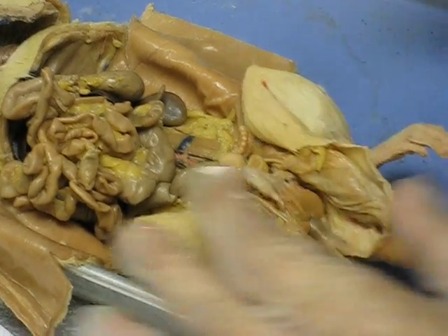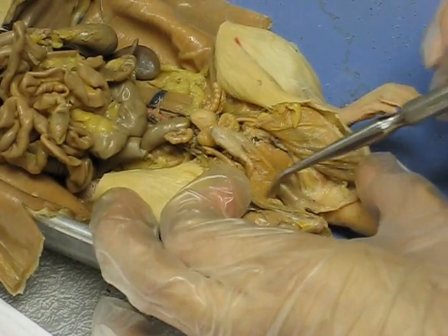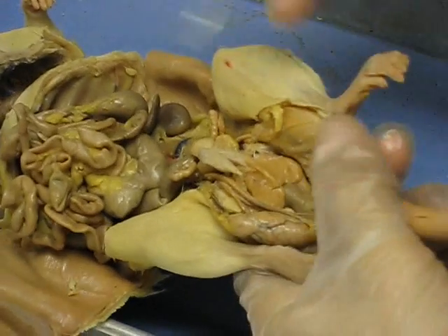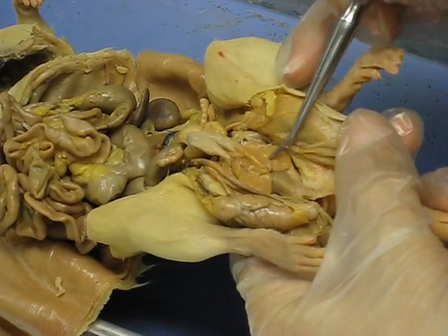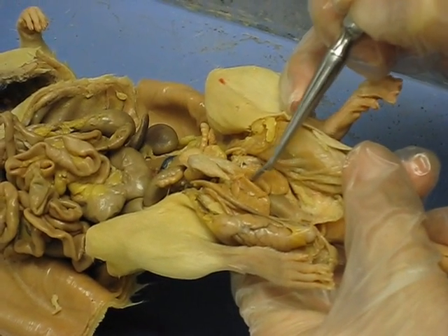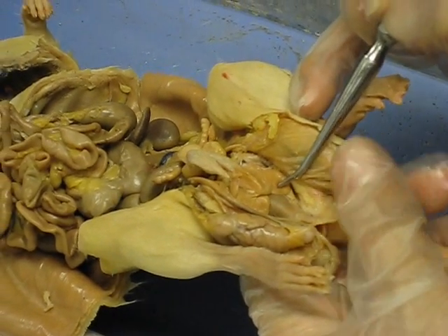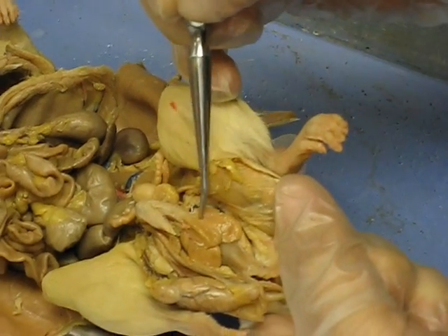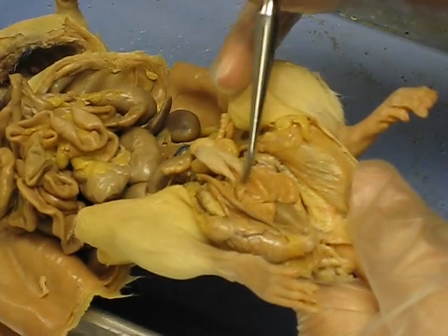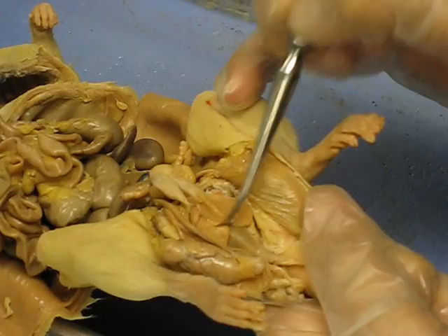Here is the penis, and these are the bulbs of the penis down here. In between the bulbs of the penis you have a muscle — this is the bulbocavernosus muscle. It has two sides to it, so I can split it here and here. And then here is the ischiocavernosus muscle, here and here. So: ischiocavernosus muscle, bulbocavernosus muscle, and the bulbs of the penis.